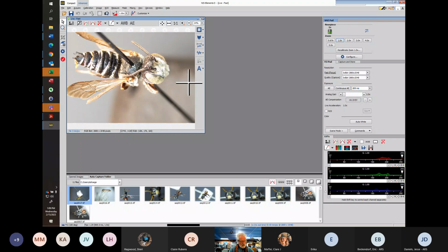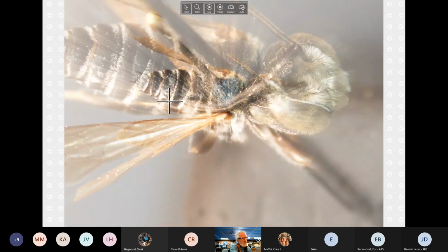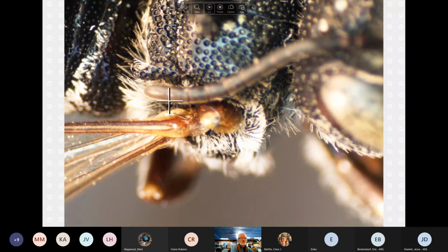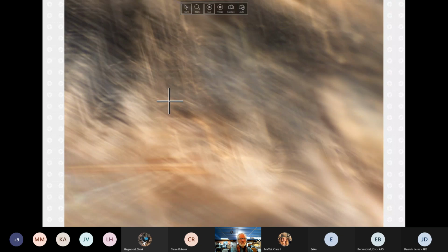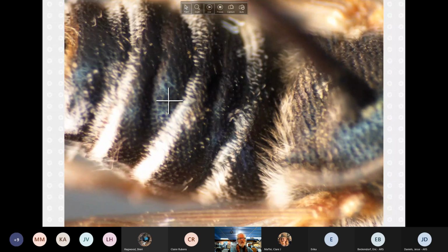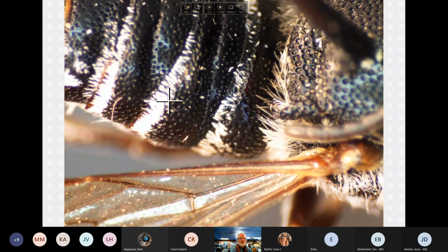So going back, what we're looking for here are two small fovea, which when you're starting out, it's difficult because if you don't have them, you spend a lot of time looking for something that's not there. So zooming in quite far. So sayi has fovea, as is octodentata. They basically are going to be the same in presentation, but they're small.